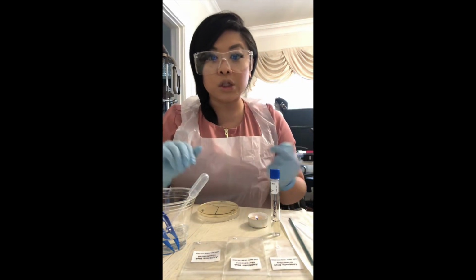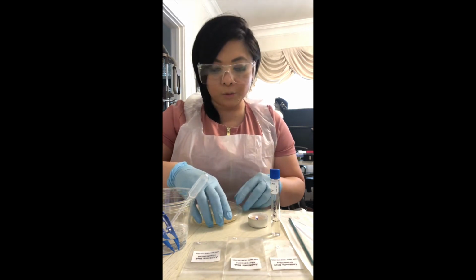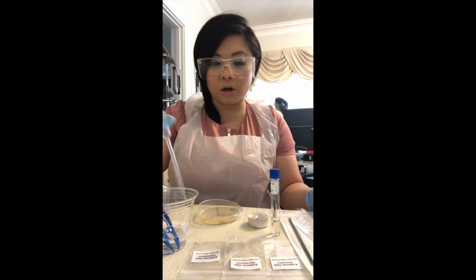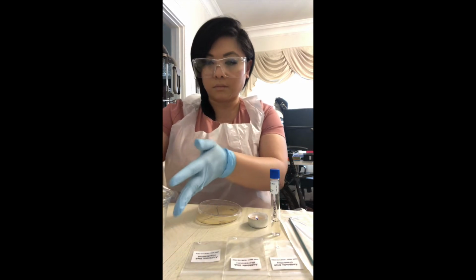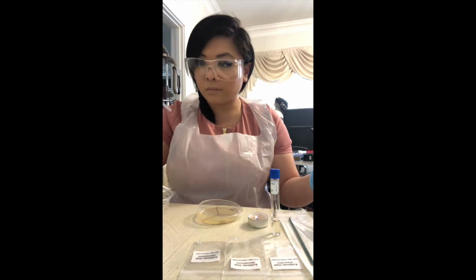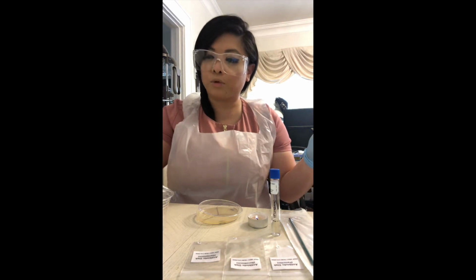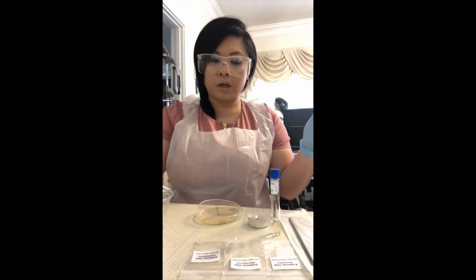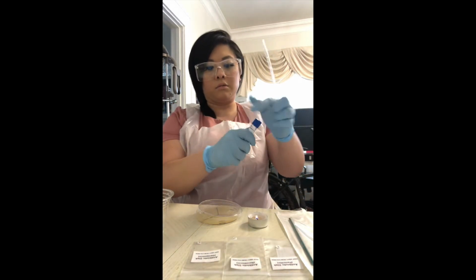So first, what I'm going to do is flip the plate over and have it a little bit open. And then I'm going to have my pipette. It's been sitting in alcohol. I'm gonna make sure that it's dry. Then I'm gonna collect from my active culture broth Staphylococcus epidermidis. But first, I'm gonna sterilize the lip by passing over the flame.